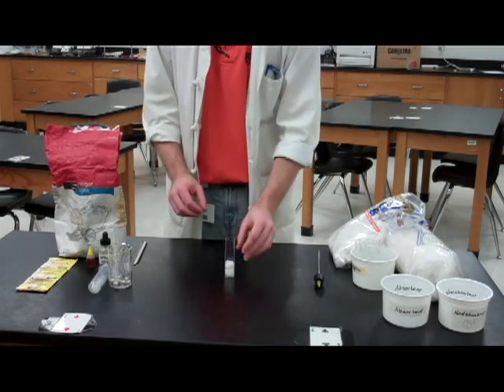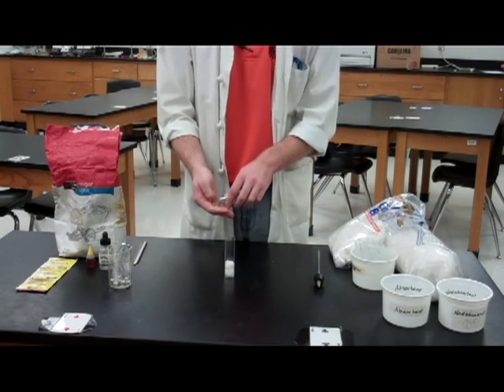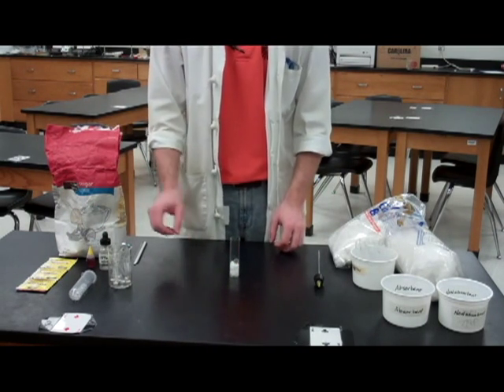Once it's covered, your test subject will go in next. You can do a control with basic glass beads, and then any organism that will fit into your chamber can be used as a test subject — it just goes right on top of that non-absorbent cotton.